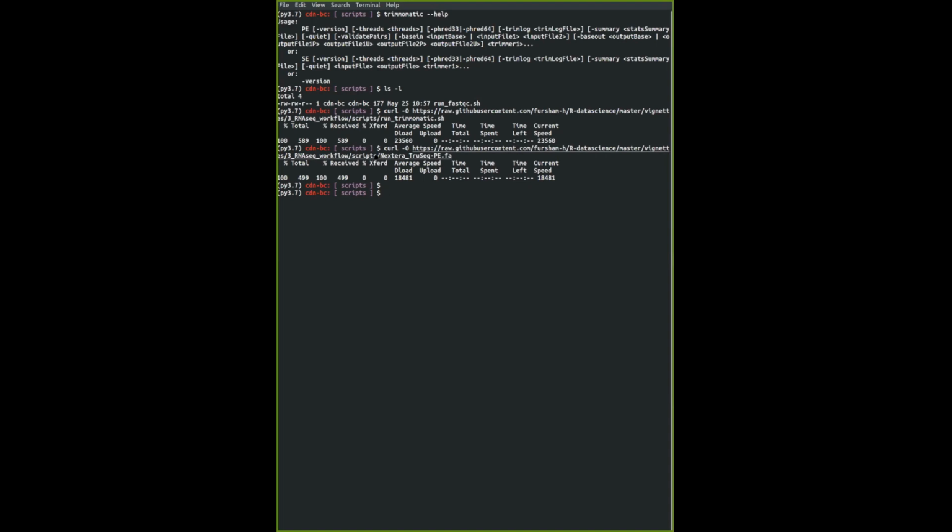So these are the two platforms that are commonly used to prepare libraries. I included both into one FASTA file. You can use this in your own experiment because it's actually exhaustive, so you don't have to change or redirect yourself to other adapter sequences. All right, let's have a look at what this script looks like.